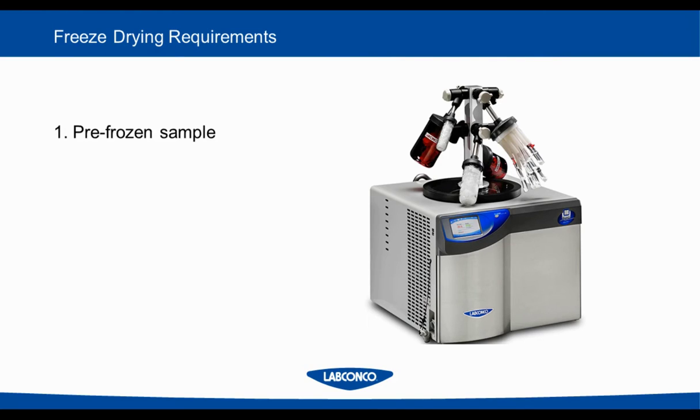There are 4 important criteria that need to be met in order to freeze dry successfully. The first requirement of freeze drying is that you must have a pre-frozen sample before you start your run. As the vacuum pulls down on the freeze dryer, you may see the sample begin to melt until the appropriate vacuum level is met, so it's important to have a pump that's in good working order.